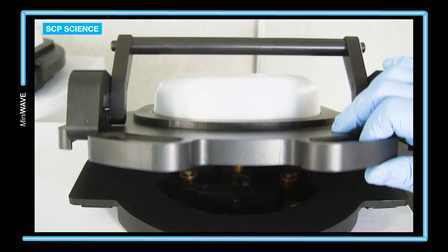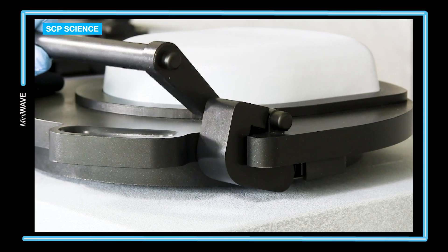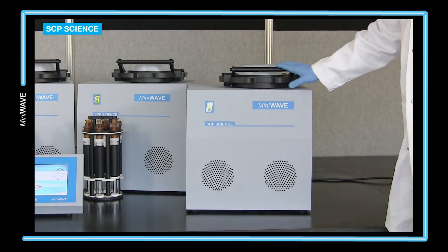Placement of the rack is easy as pictured here. The lid is then securely closed and easily locked with the ergonomically designed handle.